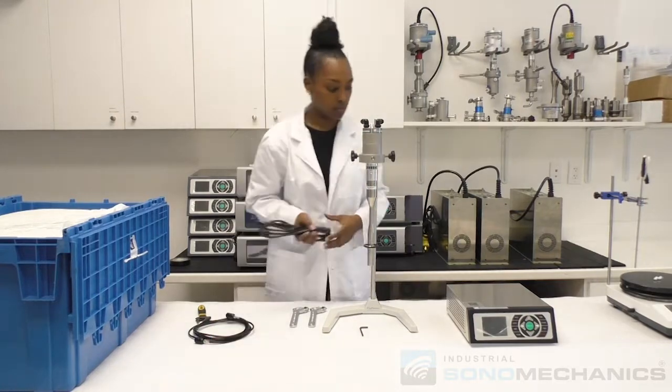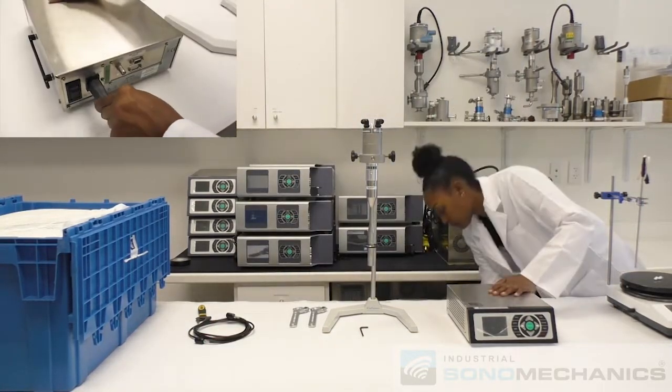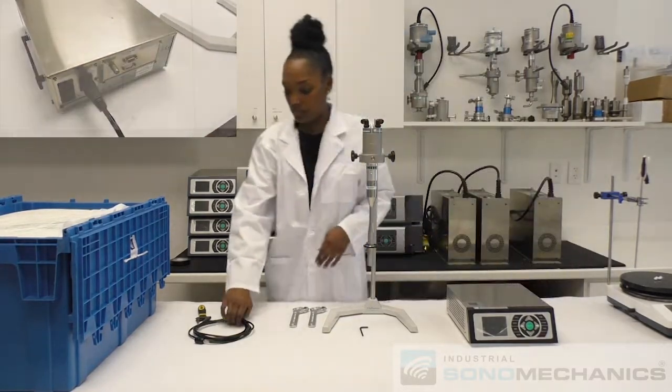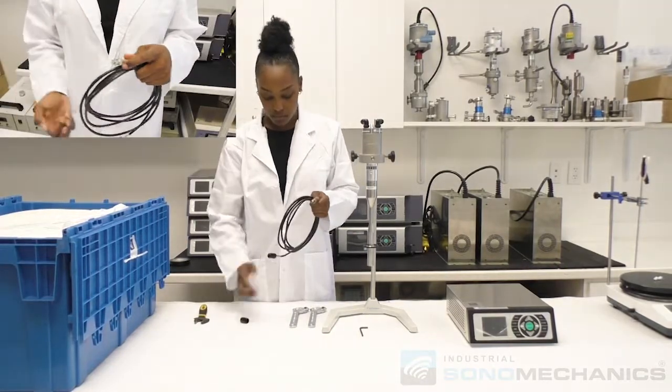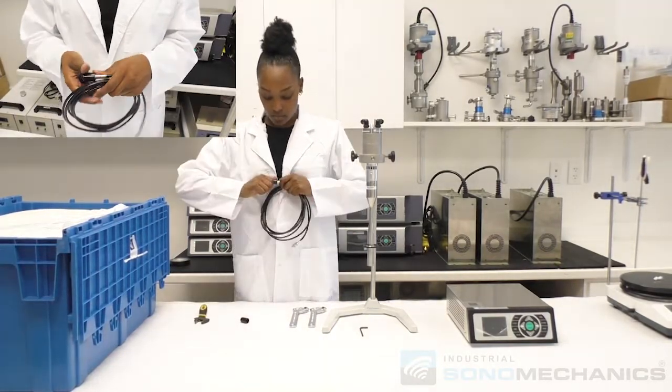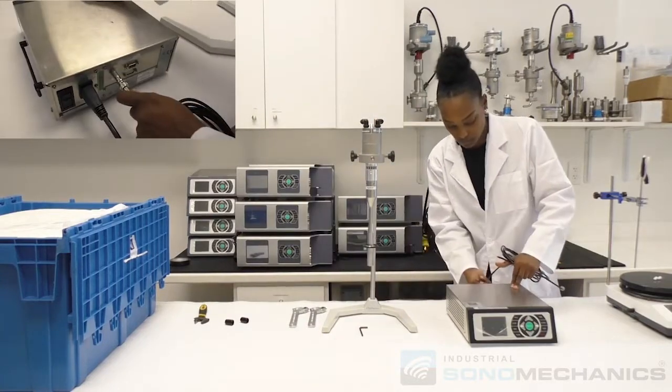Connect the power cord to the back of the generator and plug it into a grounded outlet. Connect the ultrasound cable to the back of the generator and the top of the transducer.